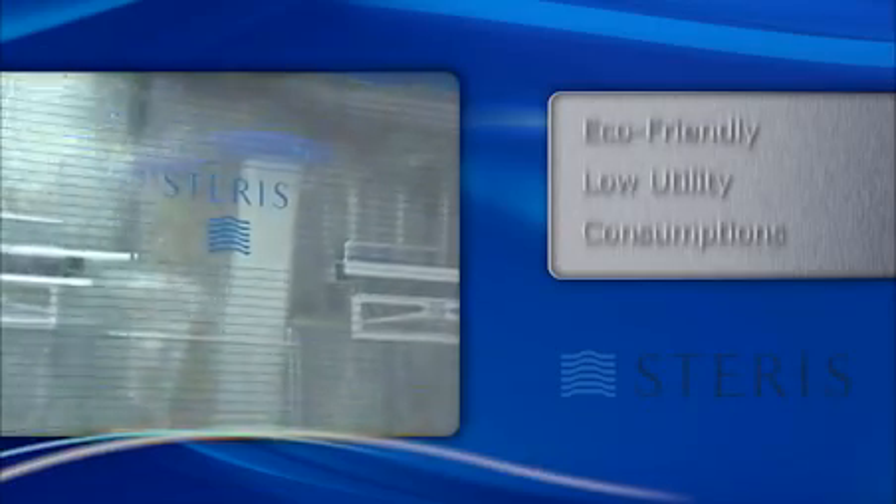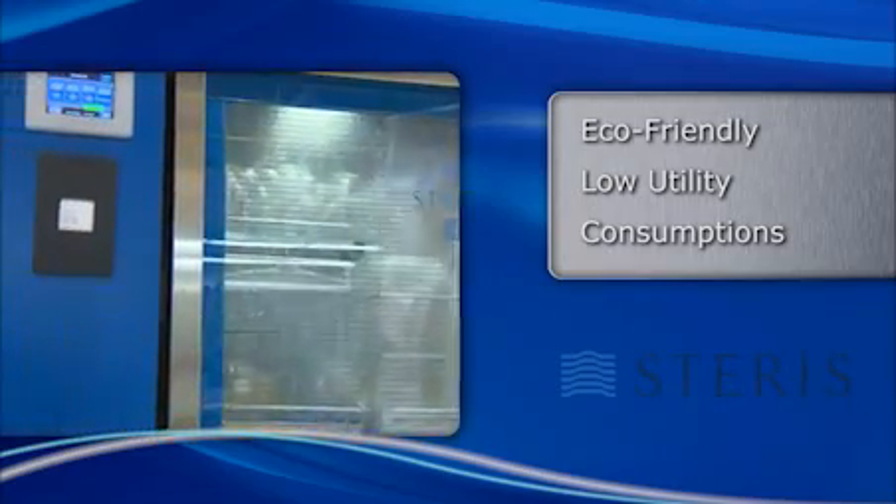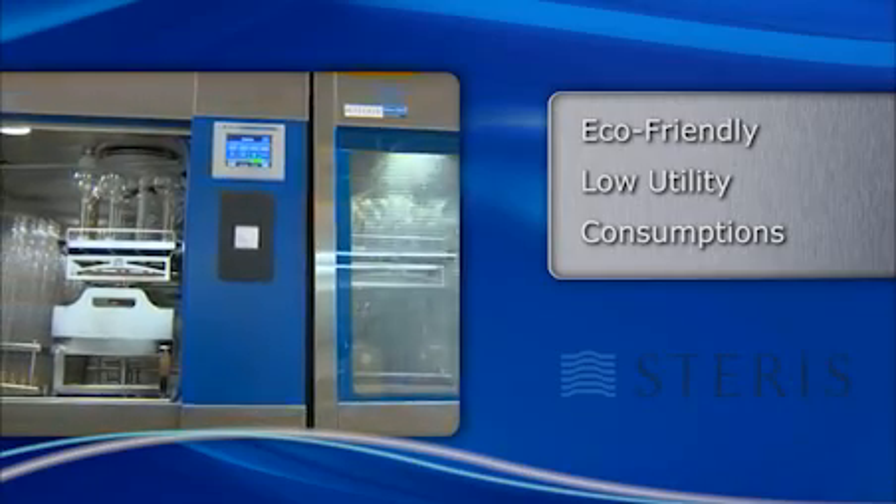Lowering your utility consumption is not only eco-friendly, but can also lower your operational costs. The XLS washers use up to 40% less water and energy than the previous high-performance models.